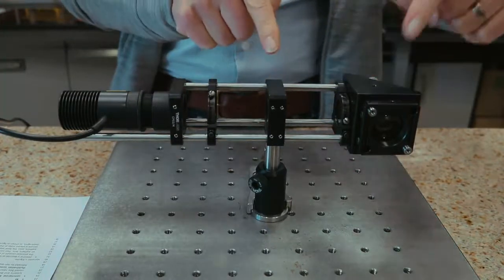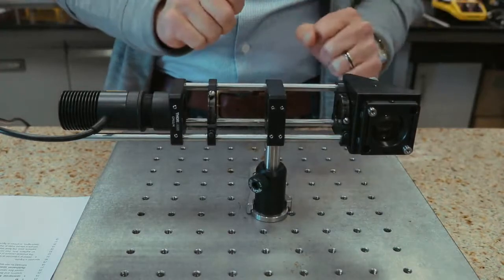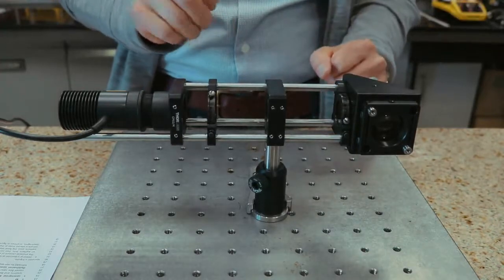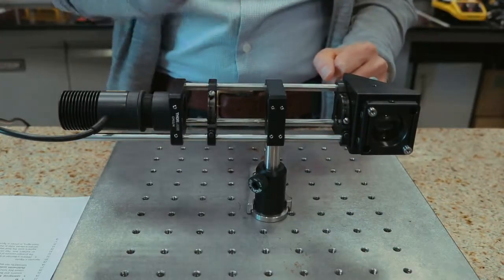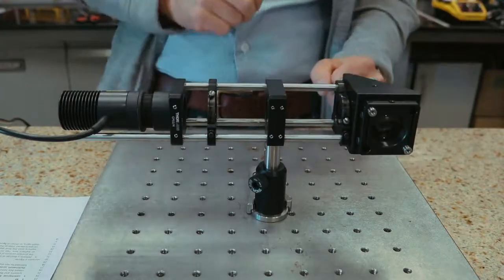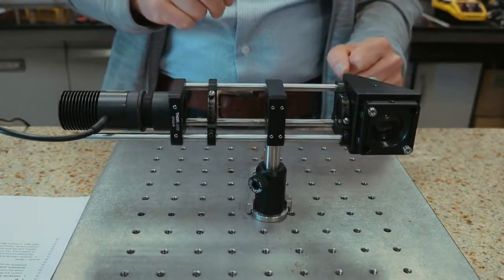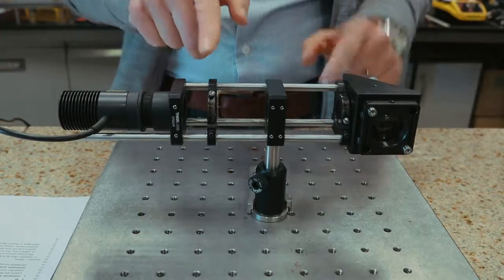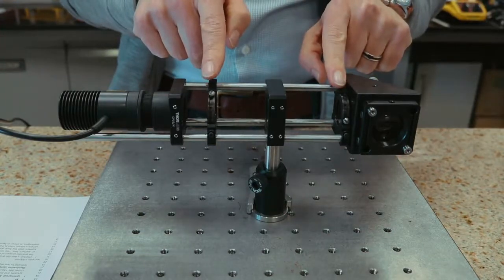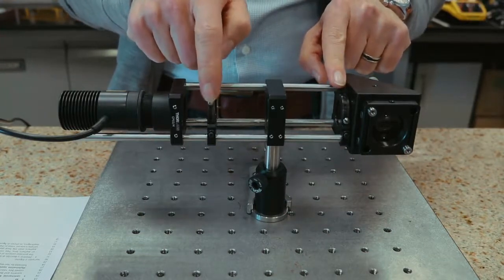Two convex lenses in a 4F configuration relay the focal plane of the aspheric lens onto the focal plane of the detection objective of the microscope, where the sample is placed. Irises at the common focal planes of the lenses act as field and aperture diaphragms.